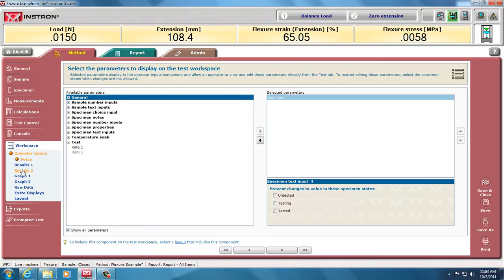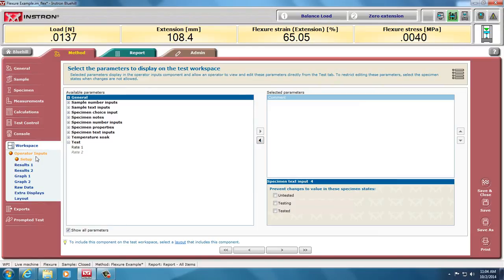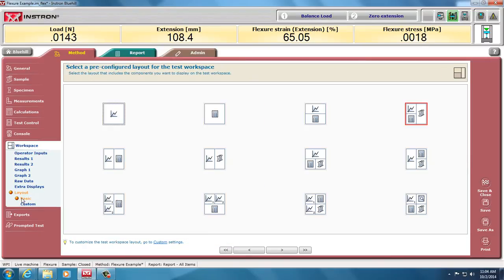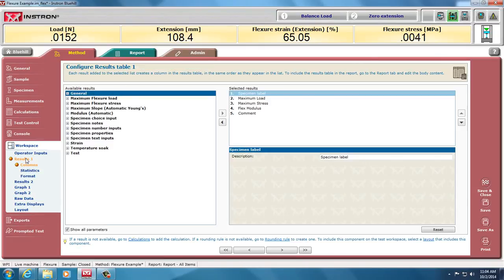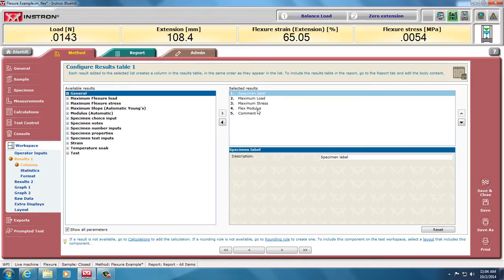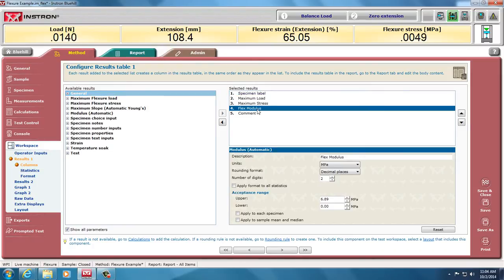Then we go to the workspace, which is where we set up the type of test we want to do or what we want to see, what kind of calculations we make. We can go, I can start here at the layout or I can start at the top, but the layout, I basically want my two graphs and some calculations. But what do I want in those calculations? I go to results. Here it's already put my specimen label, my max load and stress, my flex modulus, which if it's truly linear elastic isotropic material will be the same as a Young's modulus.